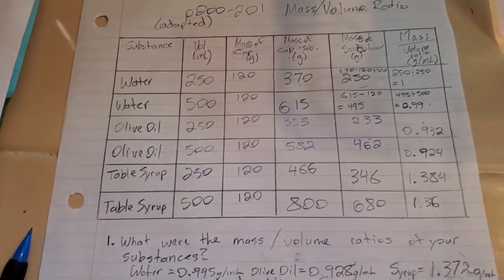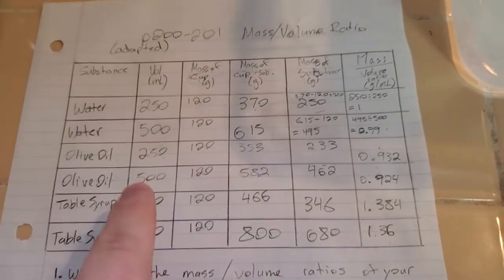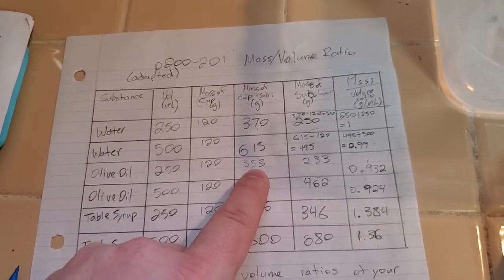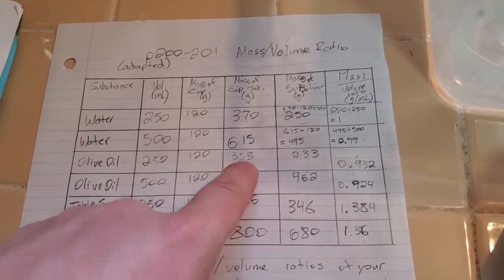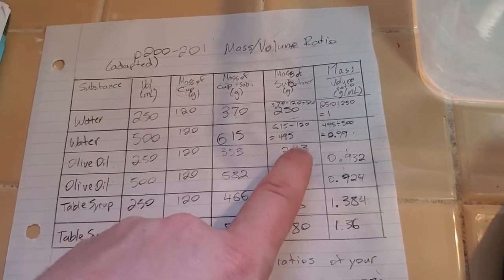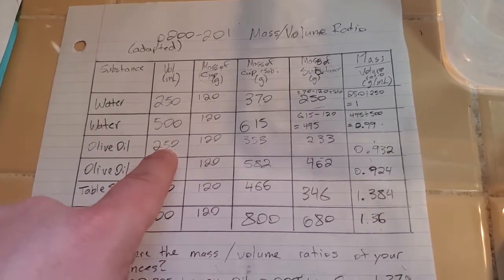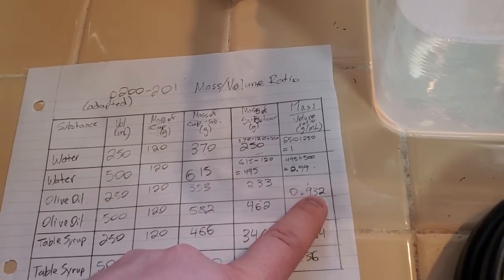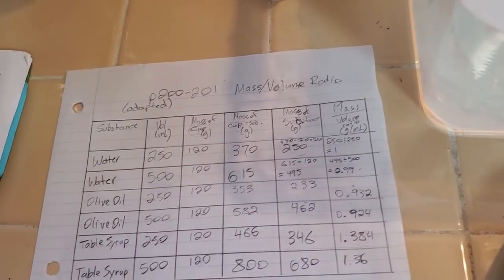All right, so I just finished doing this little experiment here with olive oil and table syrup. I measured out 250 milliliters of olive oil, and the mass that I measured on the scale was 353. That had the cup included, so I had to subtract the mass of the cup, and I ended up with 233. Following the same pattern, to find this last column, I took the second last column and divided it by this second column. And I ended up with 0.932 grams per milliliter. Grams divided by milliliters, that's where we get our unit, gram divided by milliliter.